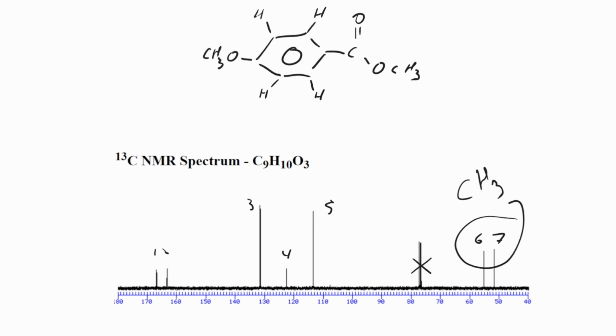And we have 1 at each end of the molecule we've got drawn above. So that's fine. Peaks 3 and 5, they are going to be these carbons here. And you can see that there are 2. They're in exactly the same environment. There is a mirror plane running through this molecule. So we would expect 3 and 5 to be about twice the height of 6 and 7, which they are.